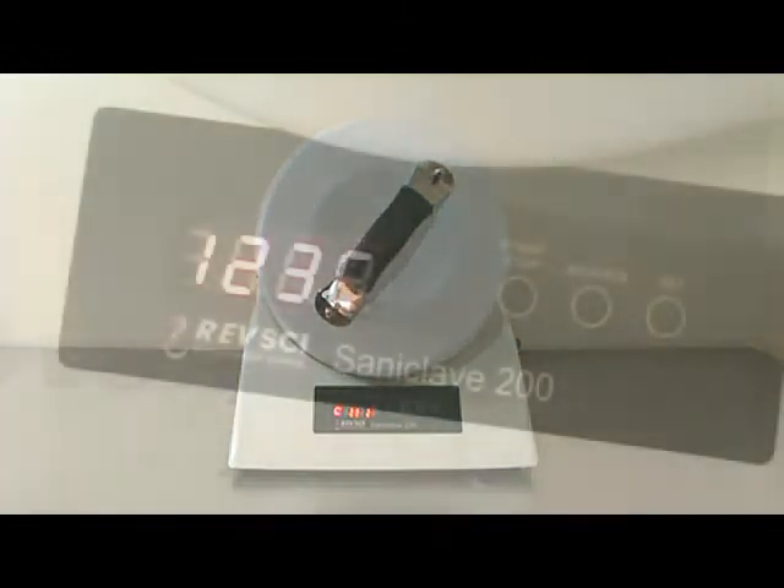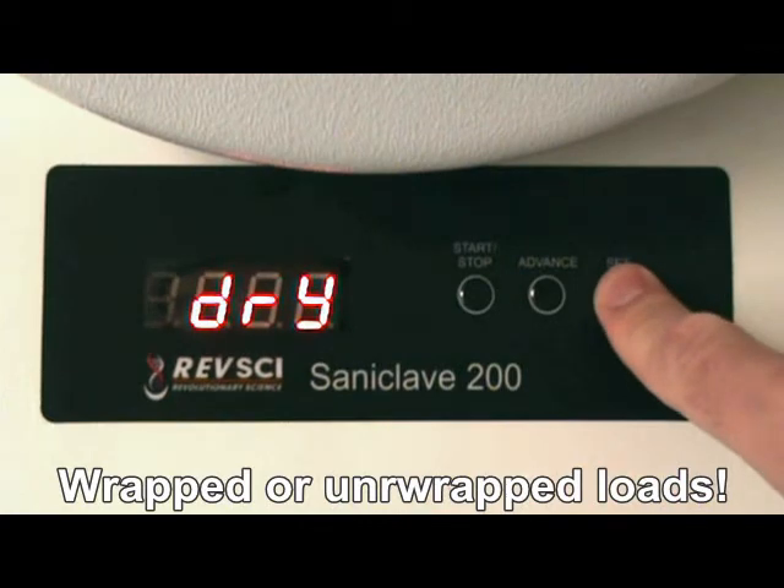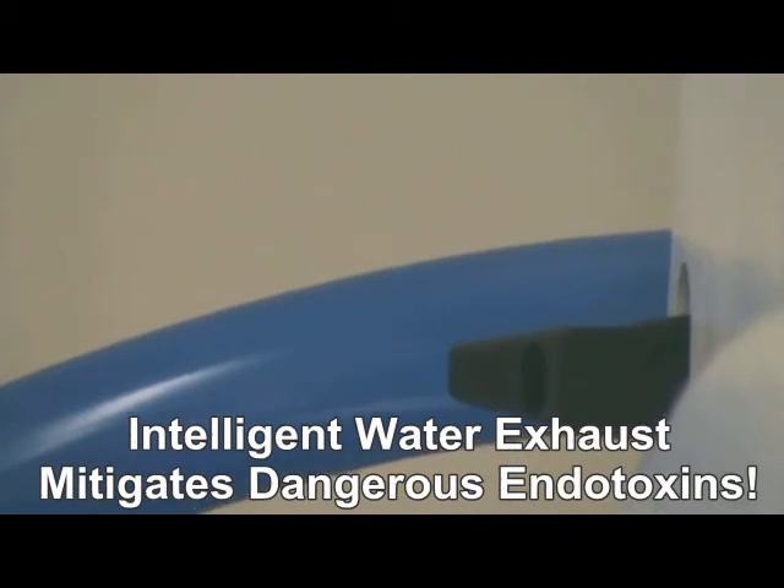Set the cycle time or initiate the dry mode by toggling between wrapped and unwrapped loads. With a built-in intelligent water exhaust system, dangerous endotoxins are greatly mitigated.